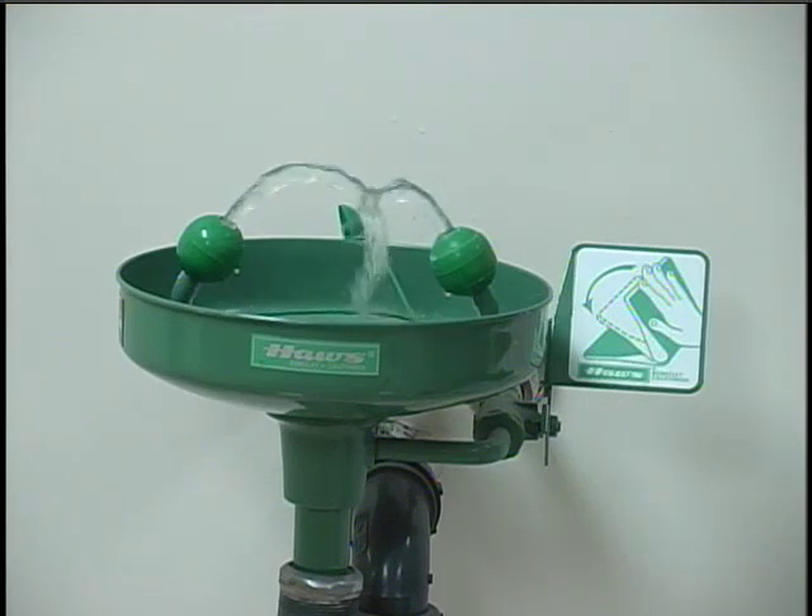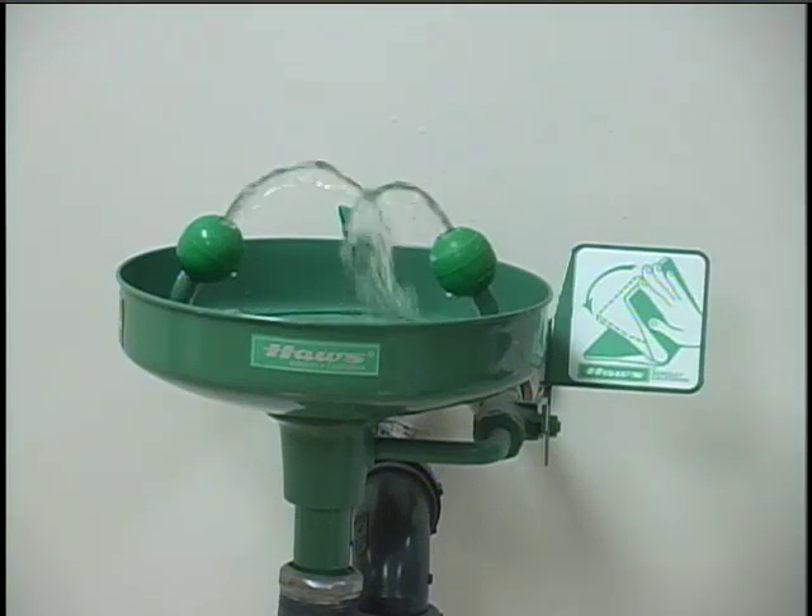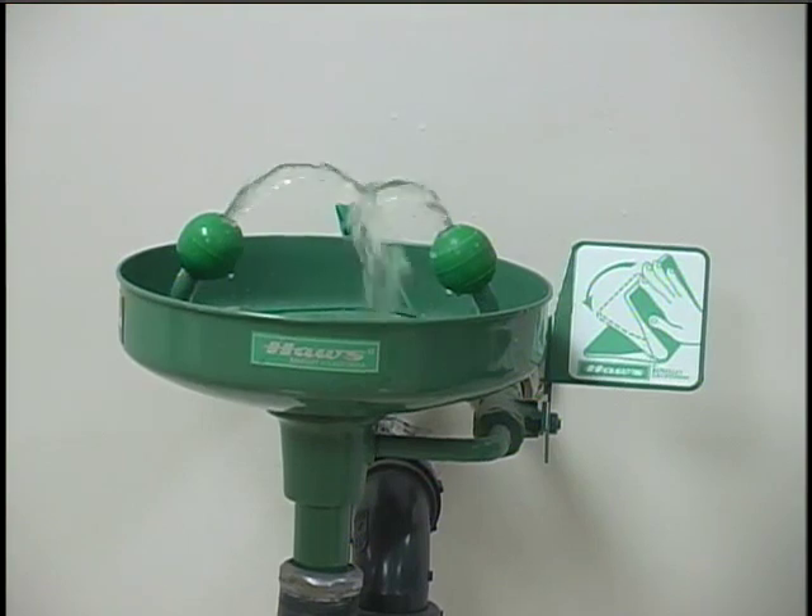For really nasty chemicals this might require 15 minutes or more, but you don't want to take any chances that you haven't gotten all the chemicals out. Of course, if you wear contact lenses you'll have to remove them when you use the eyewash because chemicals can become trapped behind the lenses.